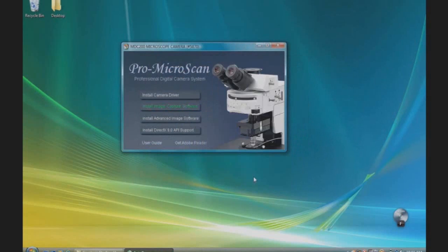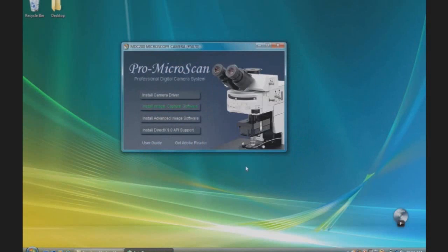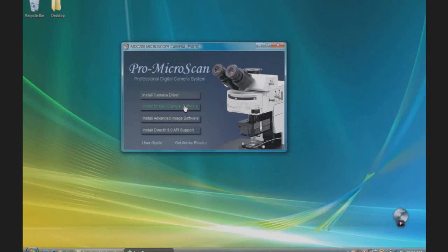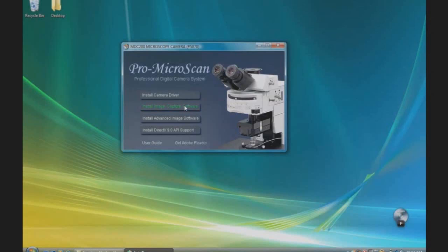For Windows XP and 2000 users, plug in your camera to a USB port. A found new hardware wizard will appear. Follow the installation steps. Restart your computer and then we will install the image capture software.